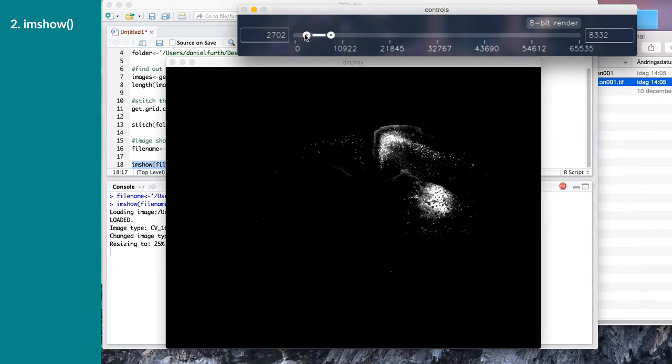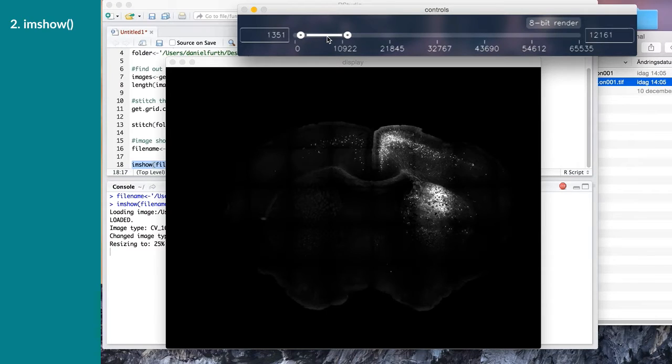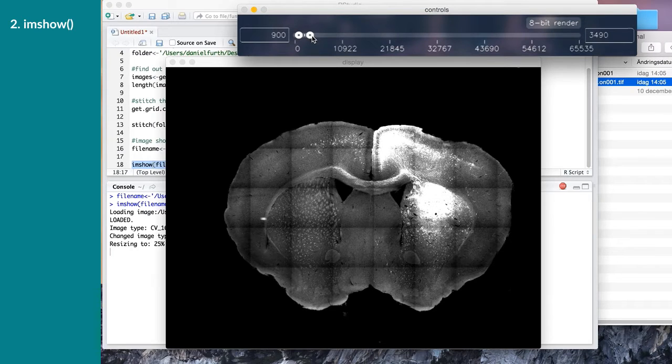Okay. So you can see that what we essentially will do with the segmentation is trying to find a range where we have the fluorescent signal that we call neurons, right? And you can see that it's roughly somewhere between here, so maybe 6,000, 20,000, something like that. In that range we have real GFP signal. So we're going to look for neurons in this range. So this you roughly set just once per experiment. And then also you need to provide where we're going to look for the autofluorescence, which we will use in order to find the brain section.